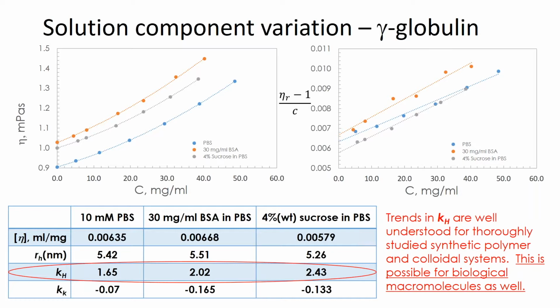And this parameter, since it's the prefactor in the expansion for the viscosity, is going to influence how rapidly the viscosity rises with concentration, which is going to be important to the application. So you can use this to guide you as you formulate and see how changing your formulation is going to change how these components are interacting.